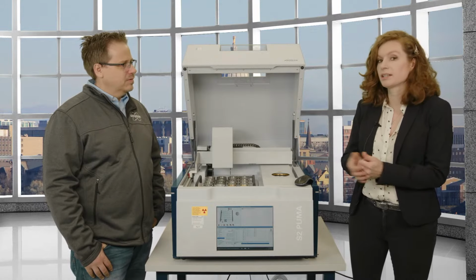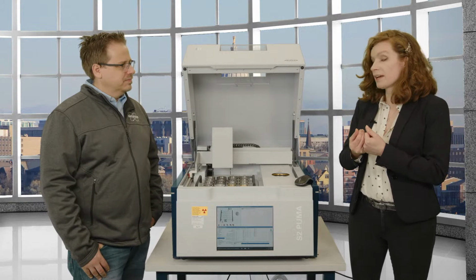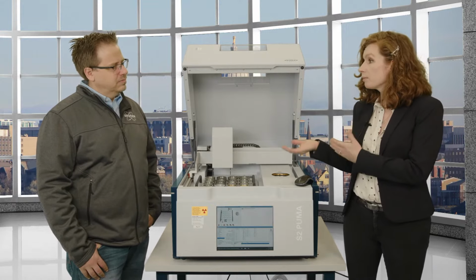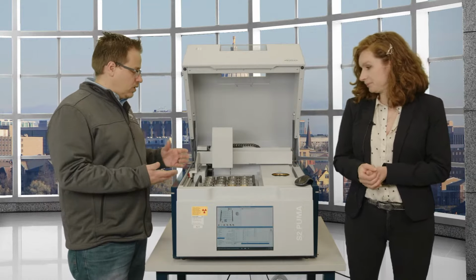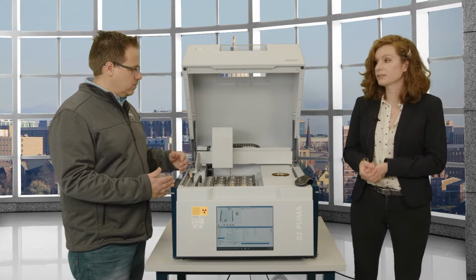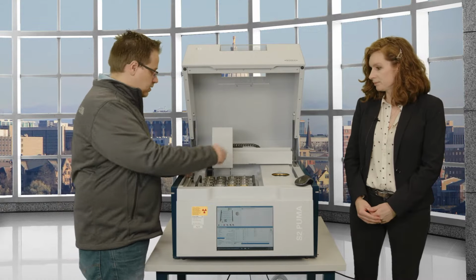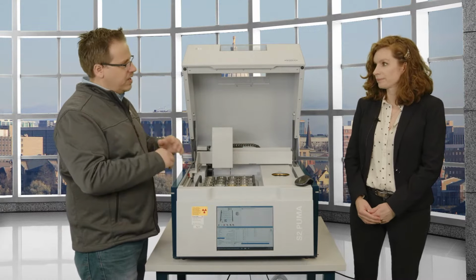Other elements around it. So if you want to measure something like that, depending on how many elements of interest are there and how convoluted it is, you might want to go to a WD system, and you might want to set up a calibration. The benefit of one of these machines, though, is that it's less expensive and takes up less room. It still has that sample changer. So, for example, if you were doing scrap, you can throw all the samples in, walk away, come back, there's your data.